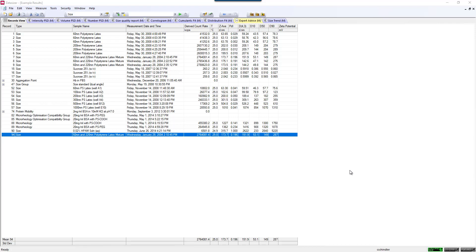This is a video showing how to export data in the Zetasizer Nano Series software. There are many ways in the software that you can get data out, whether it's just to create a table, or you want to replot some data, or you're making lots of measurements and you want them to automatically export as you make the measurement.